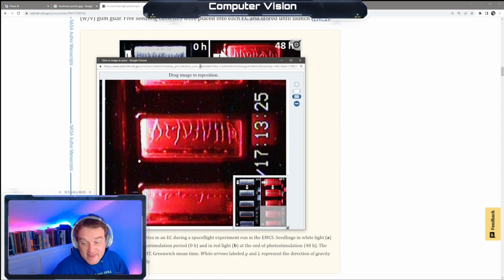There were 10,000 photos, I believe, or at least 10,000 cassettes, 10,000 of these images. So we had 80 some cassettes, and we had 30-minute intervals, and they ran for 2 days, and we had 3 genotypes, and we had 3 conditions, we had 2 light conditions, and then we had 5 gravity levels, and so you can see those all multiply together, right? So there's tons of pictures.